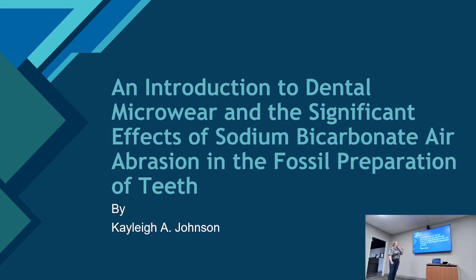But this is a presentation on my master's research, so it is a large and long title, and this is edited. This is not the original master's title even. But really today what I'm going to talk to you guys about is dental microwear, and then basically the effects of sodium bicarbonate, which is baking soda, and how that can affect microwear, because it is something that we use in fossil preparation all the time.